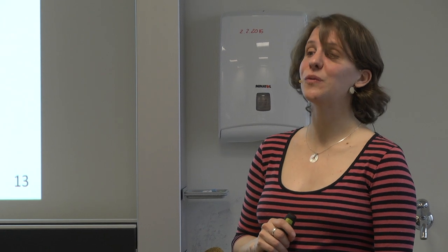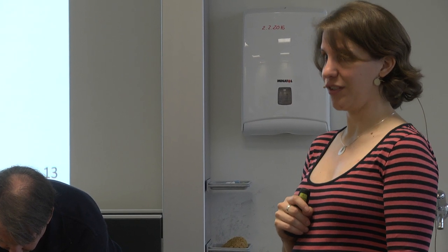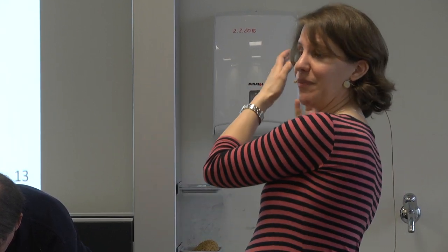So you need a spectrum, that's where you start. And the easiest way to get a spectrum is by a peptide. Maybe we can get rescued here. You need an MS2 spectrum because what do you want from this spectrum? Transitions. You want the transitions, you want not only transitions. Intensities, relation. Oh, that's not from the MS2 spectrum. But you're right, we want what's called the SRM assay. Before we can measure a peptide, whether it's labeled or isotope labeled, we need an SRM assay, and for this we need an MS2 spectra.